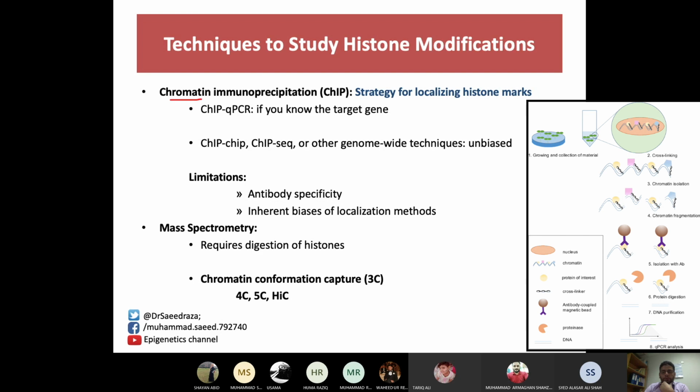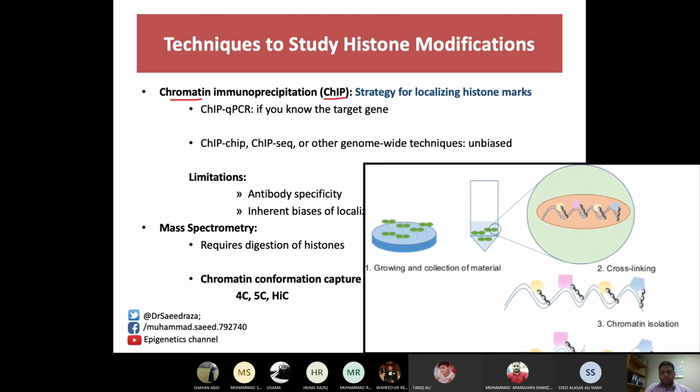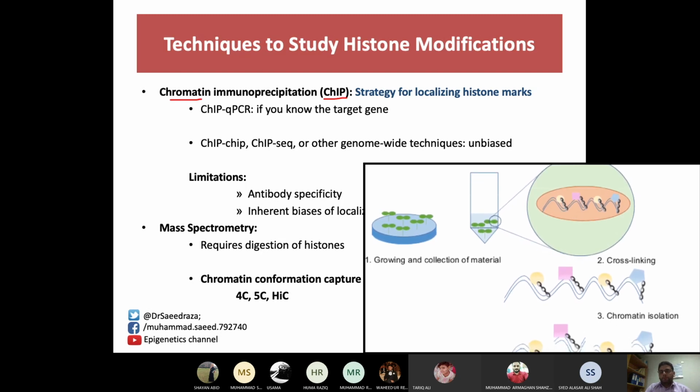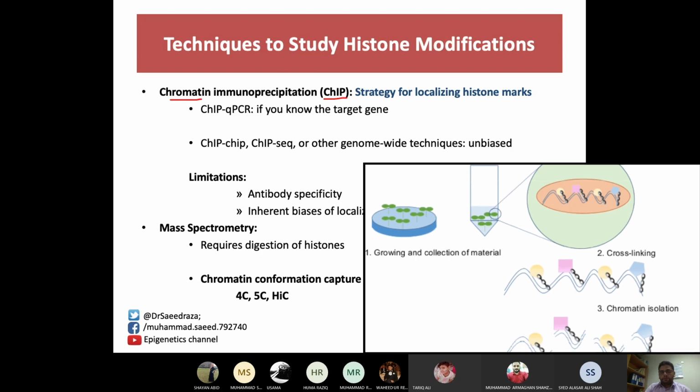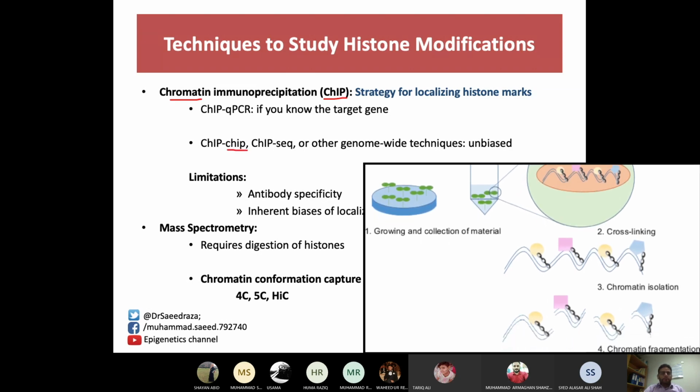So this is chromatin immunoprecipitation. Once you have done the ChIP technique, the chromatin immunoprecipitation technique, please pay special attention to its denomination, because it's something different than this chip which is down there. I'm coming back to that.